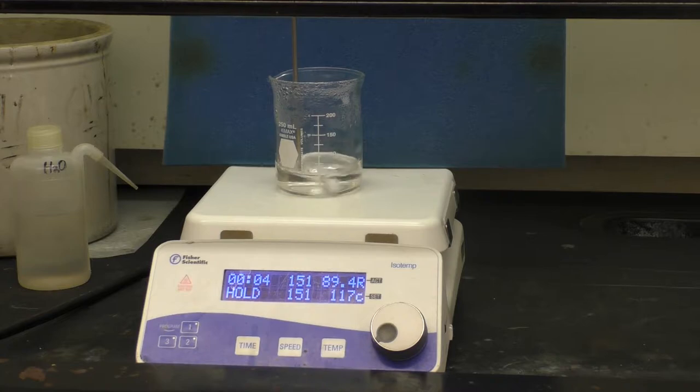All right, now that the reaction has run for approximately 15 minutes, we can take it off and turn off the stirring. Now, unlike the procedure, which says to put this directly into an ice bath, it's not generally a good idea to put hot glassware into a cold, freezing cold bath. And so instead what we'll do is we'll simply place it on the countertop to cool down closer to room temperature and then place it in an ice bath before we add the 9 molar sulfuric acid.